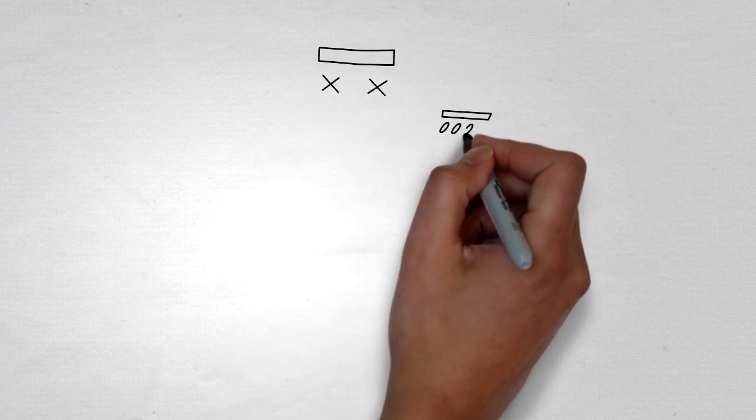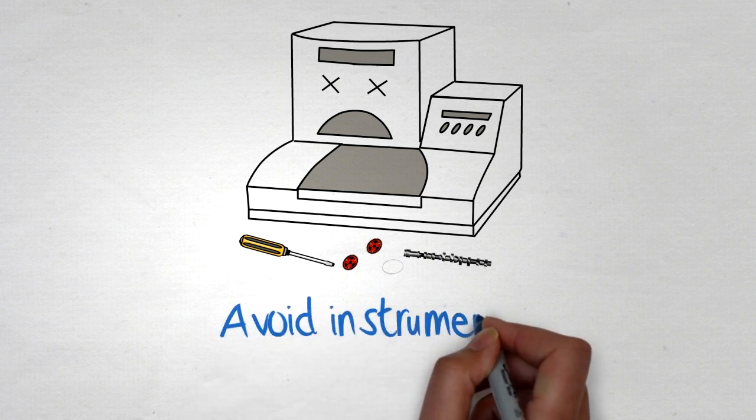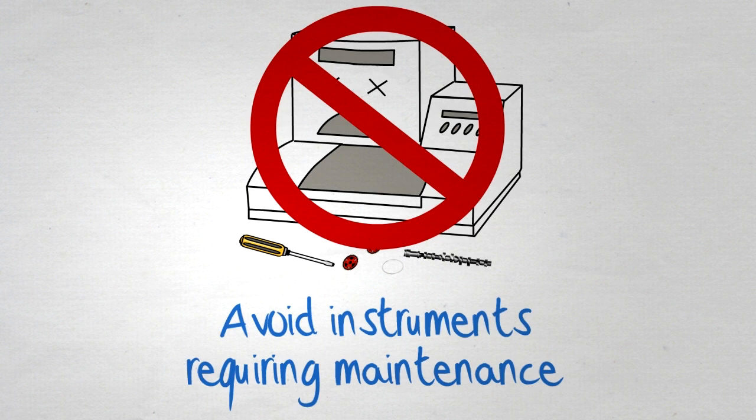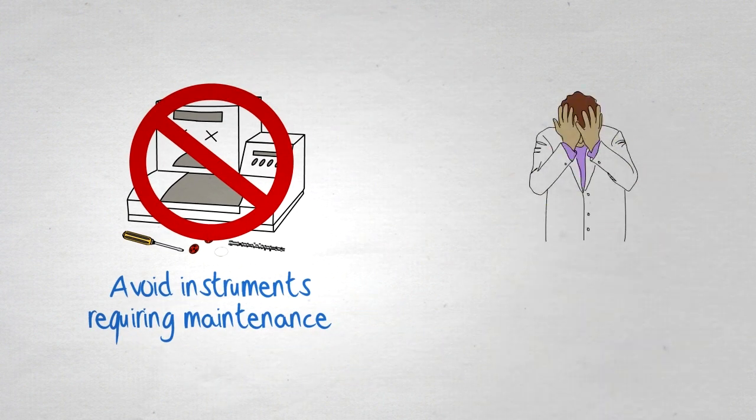Not only that, STaCS prevents you from using an instrument that requires maintenance. That's the control part of what we do. STaCS prevents rather than detects errors, helping you avoid costly mistakes.